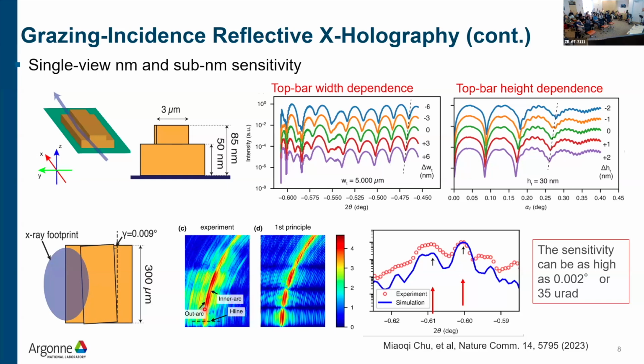Originally, we thought this was just a crappy image, right? We see that all the time when you have a bad slit or parasitic scattering. But we repeated the experiment again and again and always got this. It doesn't matter what we do with the slits. That puzzled us for a while. Then we realized this could be a Lloyd mirror effect. Actually, you are looking at two patterns with two different orientations.